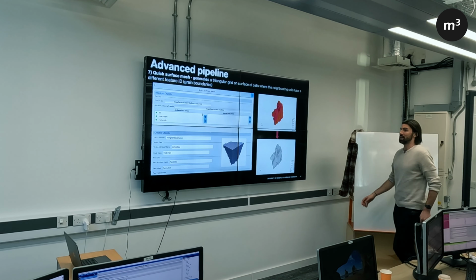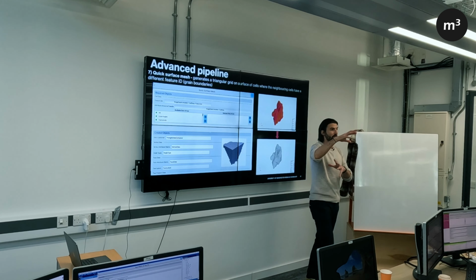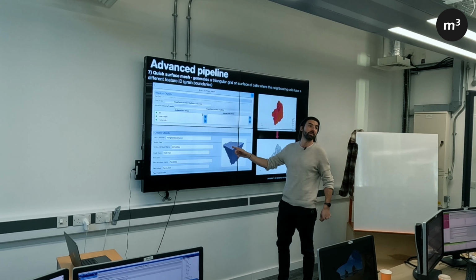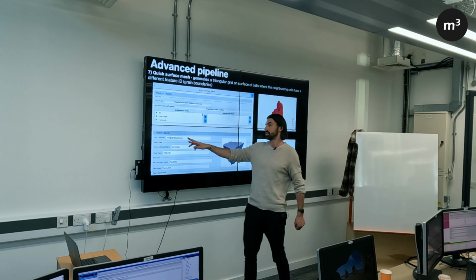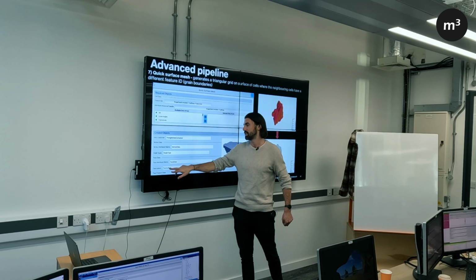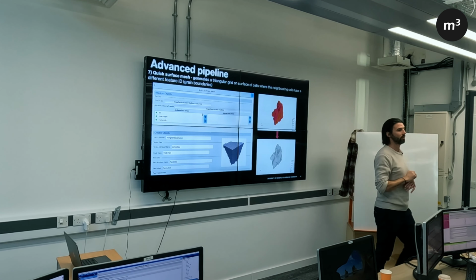So yes, this applies this triangular data structure onto our voxelated surface here. You can see it basically splits our data up into these triangles. And now, crucially, we have a whole new data attribute array with these triangle data in them. Each of these it saves as node, vertex data, and face labels. So each of these triangles now has a unique identifier.